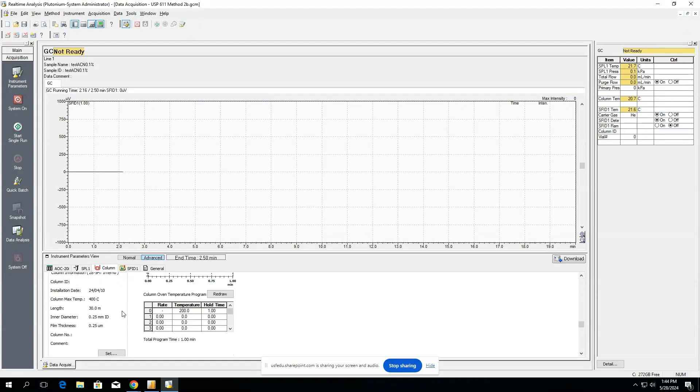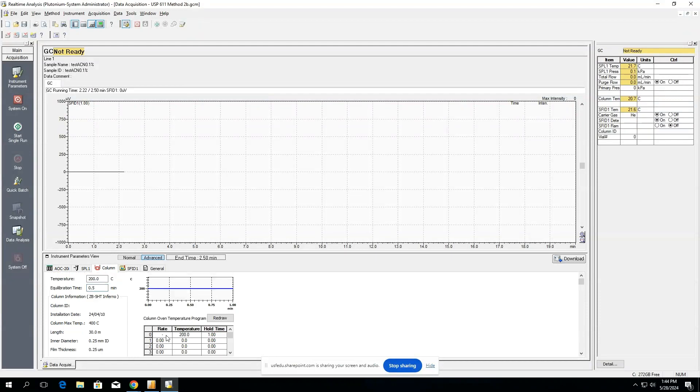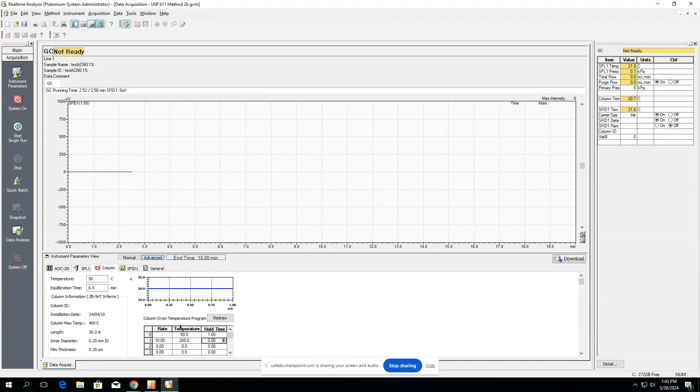There are options if you don't want to have a set method for the temperature of the column. You might want to have the temperature of the column change, and if that's the case we might want to control our rate as well as our temperature. You might want to start at 50 Celsius, hold for a minute, and then raise at a ramp of 10 degrees Celsius per minute until you reach 200, and then you might want to hold this for a set amount of time. And then we can redraw and we can see how this first one minute it's going to be at 50 degrees, and then after that we're going to raise at 10 degrees per minute until it reaches 200.